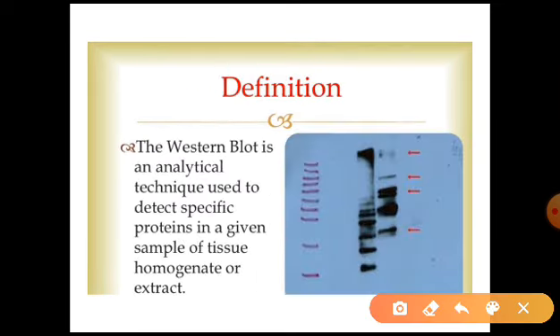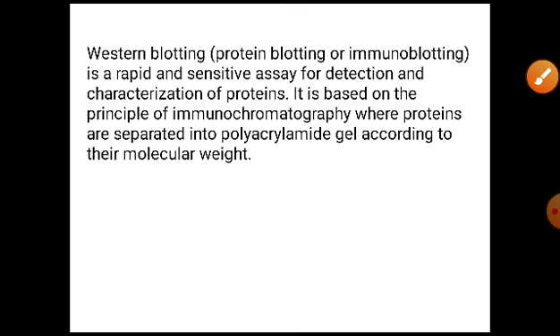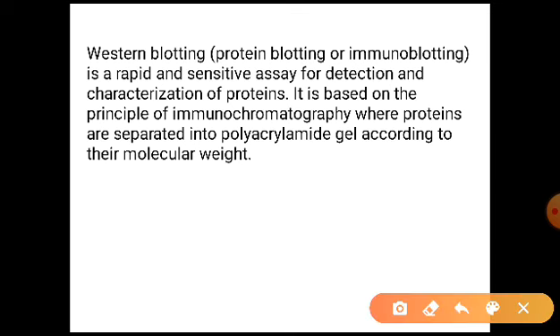Definition: the Western blot is an analytical technique used to detect specific proteins given in a sample of tissue homogenate or extract. Western blotting is a rapid and sensitive assay for detection and characterization of proteins.